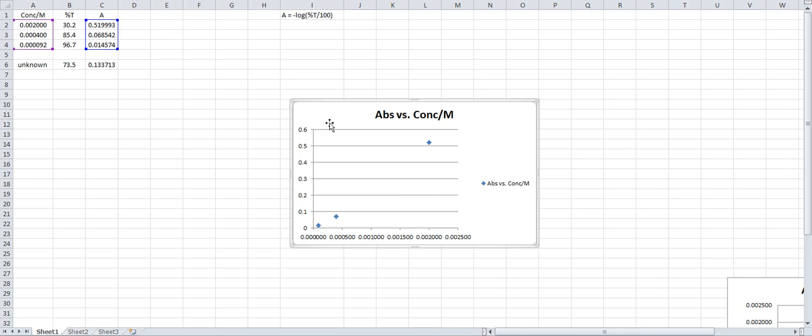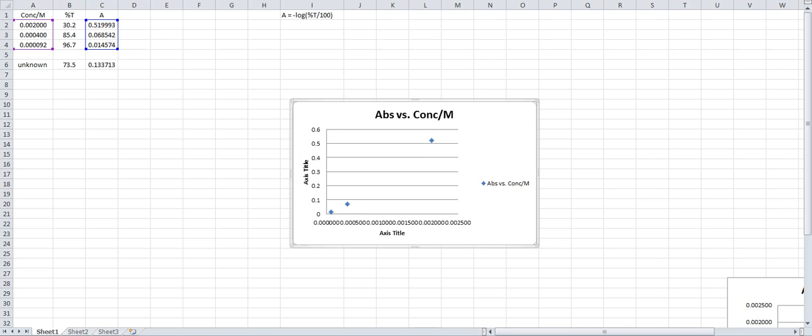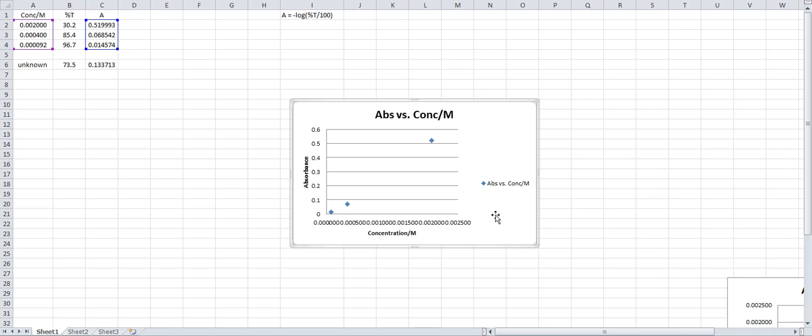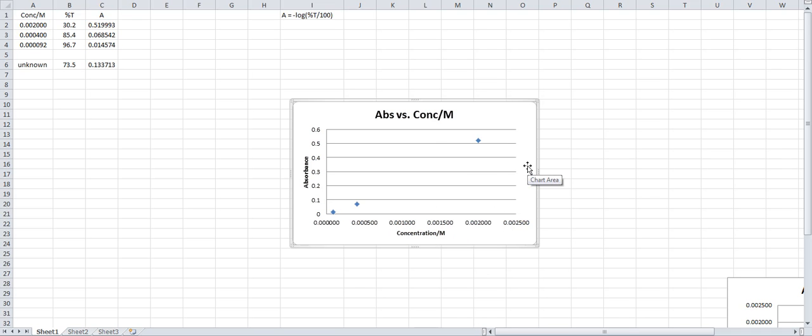You will have to label your axes. So in the chart layouts, you usually choose the first one. Click this. You type in absorbance ABS. And here is your concentration and units of molarity. And I finished that. You don't need that. Get rid of it.